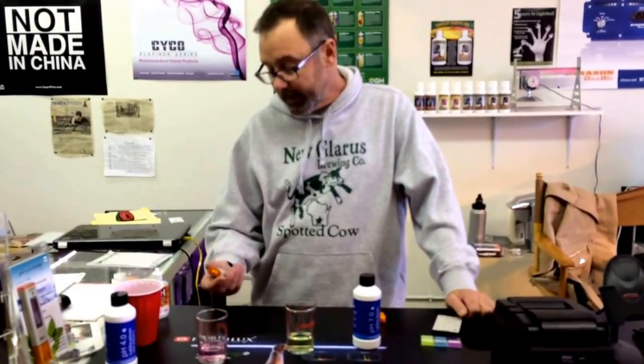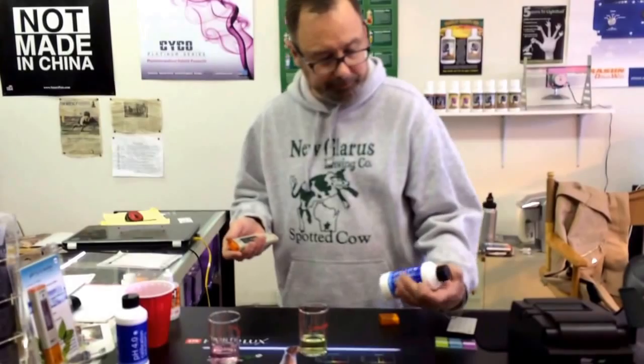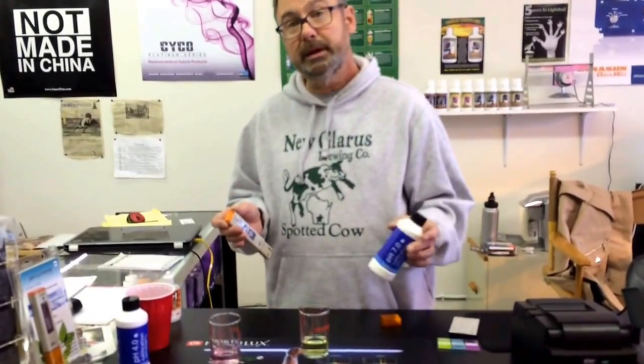Hi, I'm Phil with Simple Soil Hydroponics. Today we're going to be calibrating an HM Digital pH 80 pH meter. We'll start out with Bluelab 7.0 pH solution.